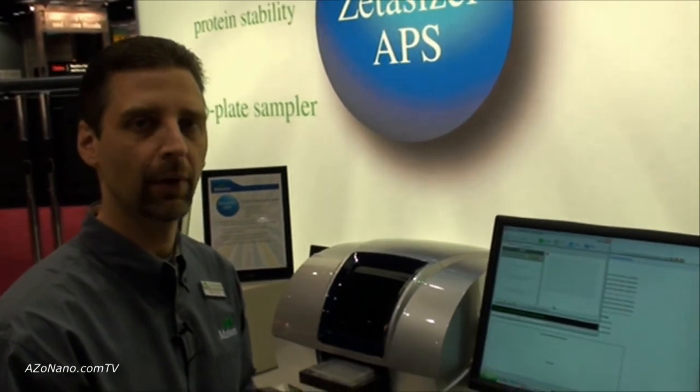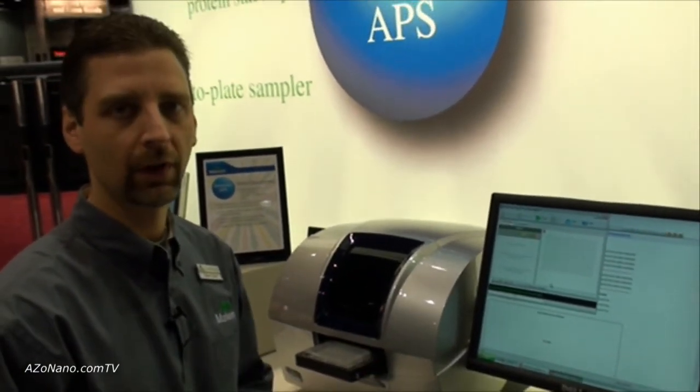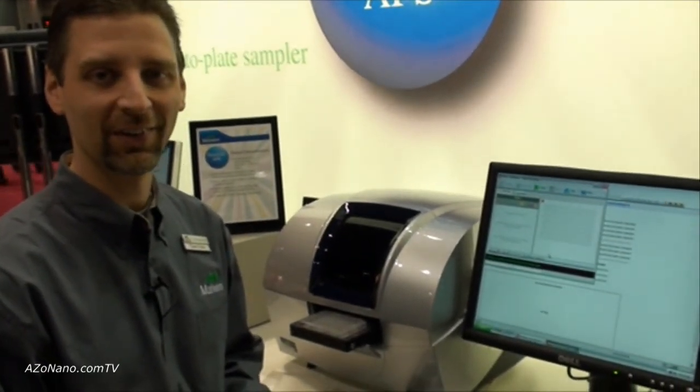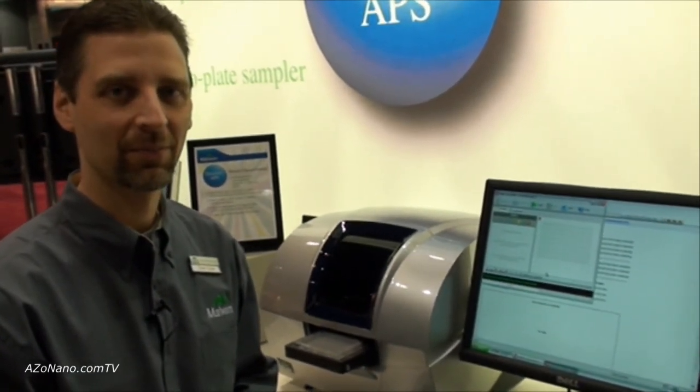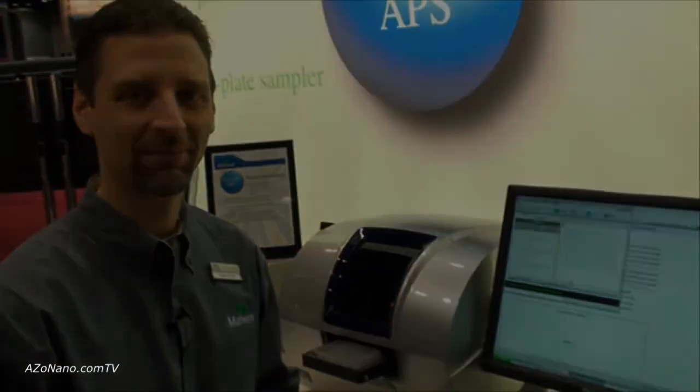Once you've defined the measurement parameters for each well, simply click start, and the instrument will automate the analysis of the entire plate. That's the basics of what we're presenting here today. Thanks for introducing us to your new Zetasizer product range and for your time.